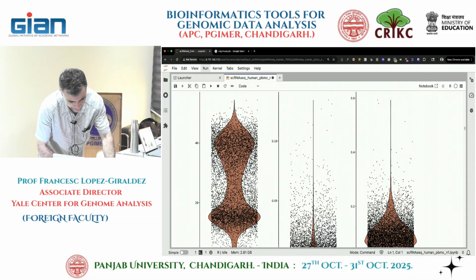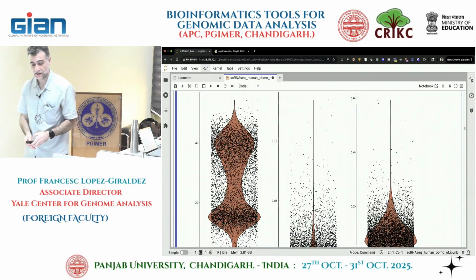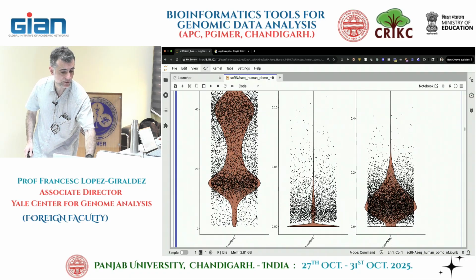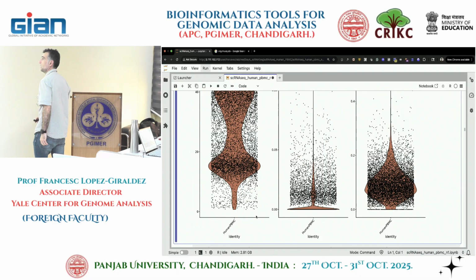So this is, I guess I did too much. You can see those plots, right? You're running your notebook on your own, so I probably don't have to show the complete plot on the screen.